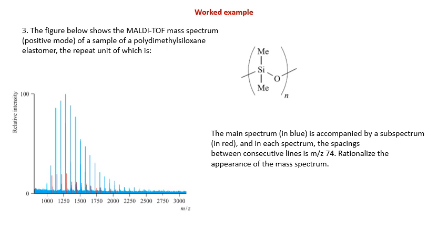Normally, a cyclic oligomer has the formula (Me2SiO)n, as shown over here. But for a particular chain length, a linear oligomer has a higher molecular mass than the cyclic one because it is terminated with a terminal methyl or OH group. So the understanding is that the mass spectrum is for the polymeric part, and the spacing corresponds to one monomeric Me2SiO unit.